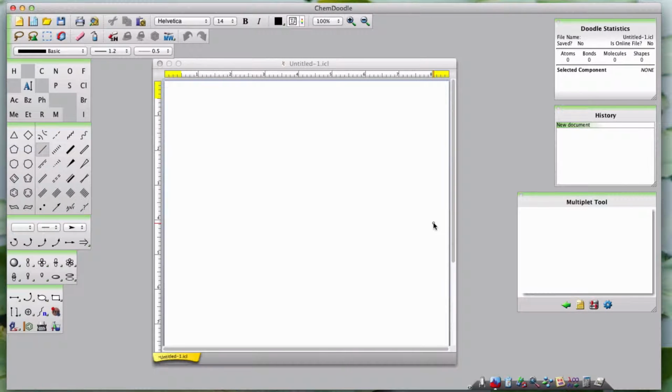The Multiplet Tool Widget is a tool for generating multiplet trees, simulating signals and producing their figures. It can simulate nuclear magnetic resonance, NMR, or electron paramagnetic resonance, EPR or ESR, signals. When you first open the tool, the main multiplet panel is left blank. You will need to use the buttons below the display to set up your simulation.